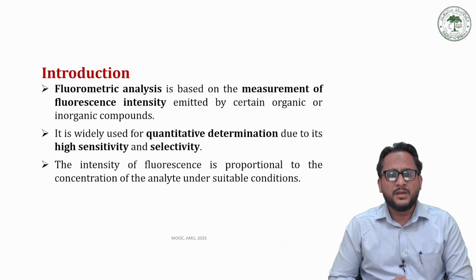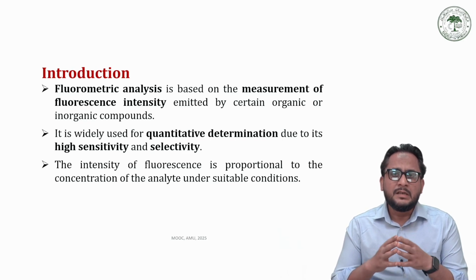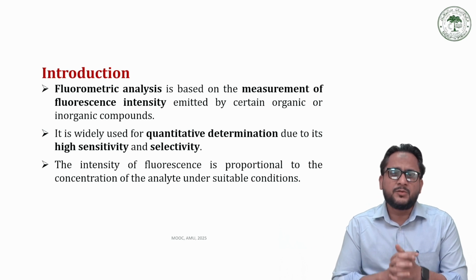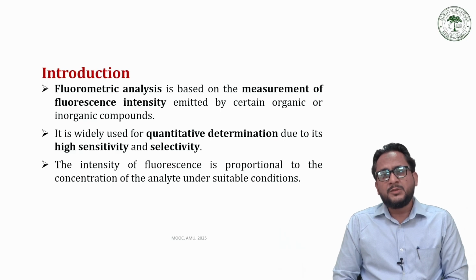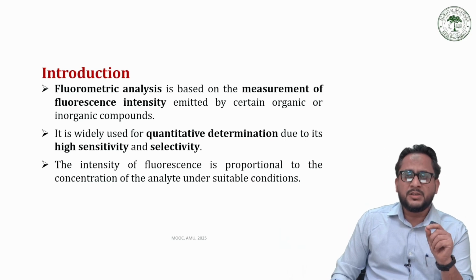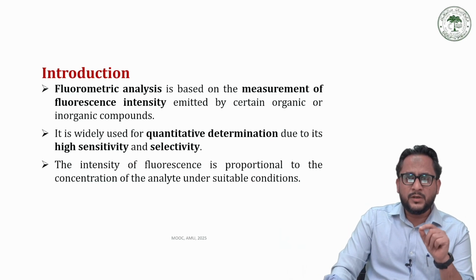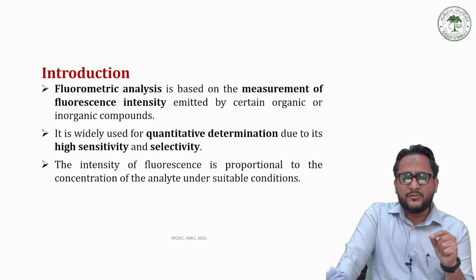So let us come to the application of molecular luminescence spectroscopy, especially the application of fluorescence spectroscopy. As we all know, fluorescence spectroscopy, conducted through a spectrofluorometer, is used in the determination of fluorescence intensity from a molecule that shows visible light upon absorption of light of shorter wavelength.